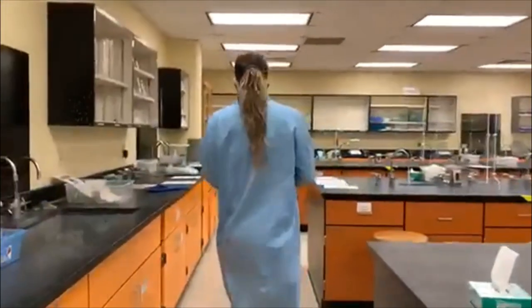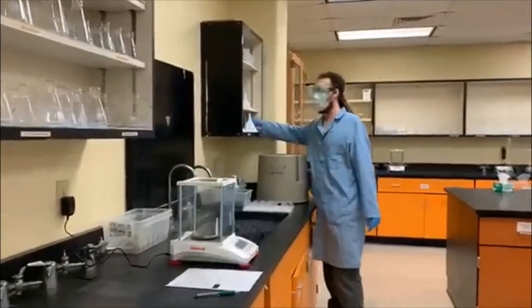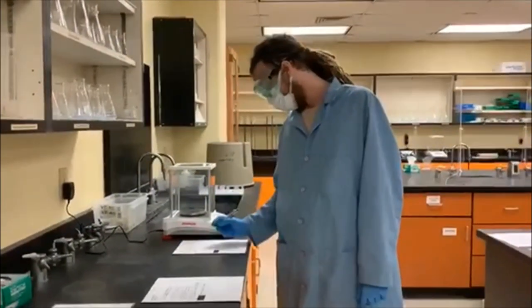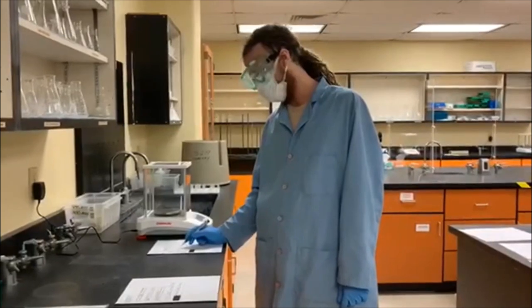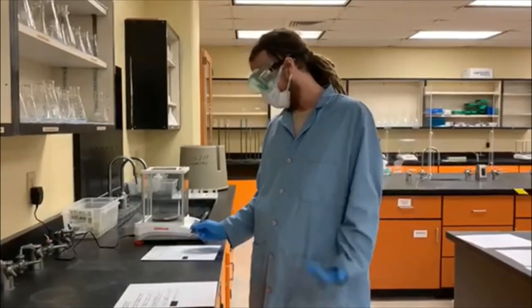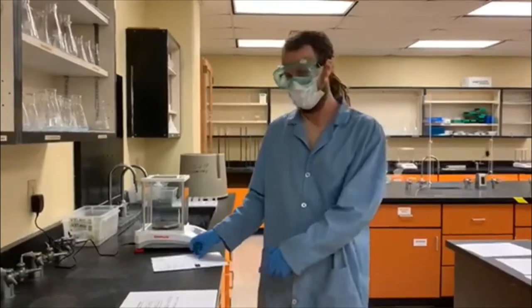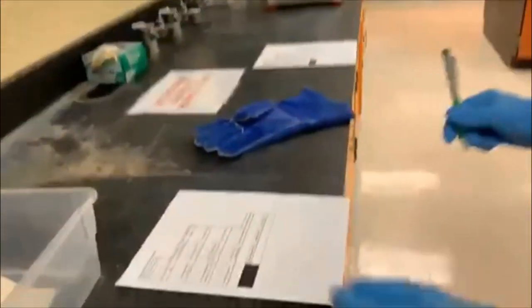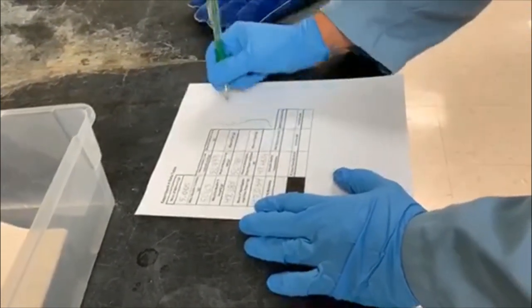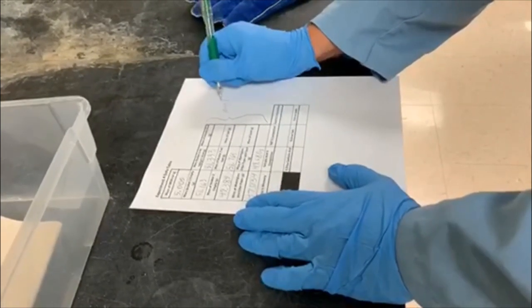Glass. So yeah, and we'd subtract the mass of the watch glass and filter paper from the mass of the watch glass, filter paper, and sand to get the mass of the sand. Then we'd basically total these three up together to get the mass recovered.